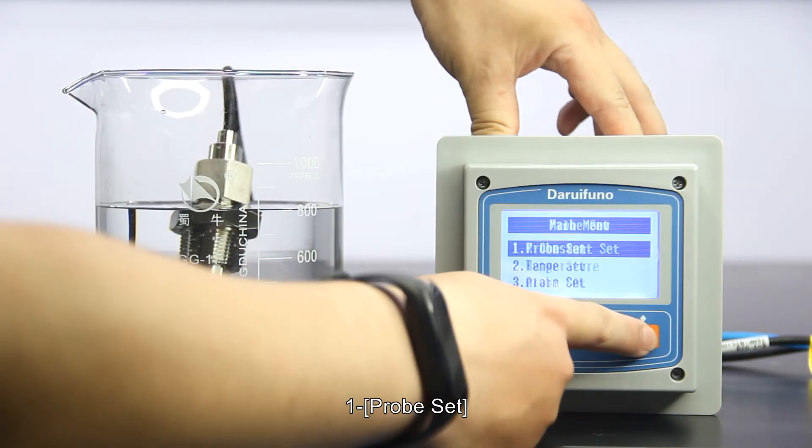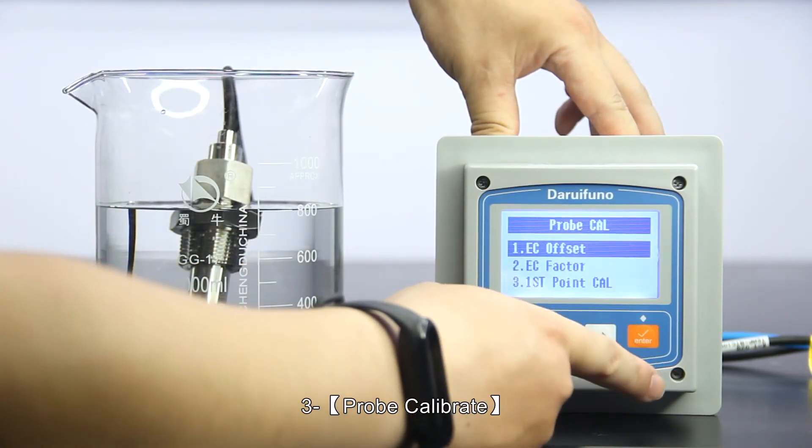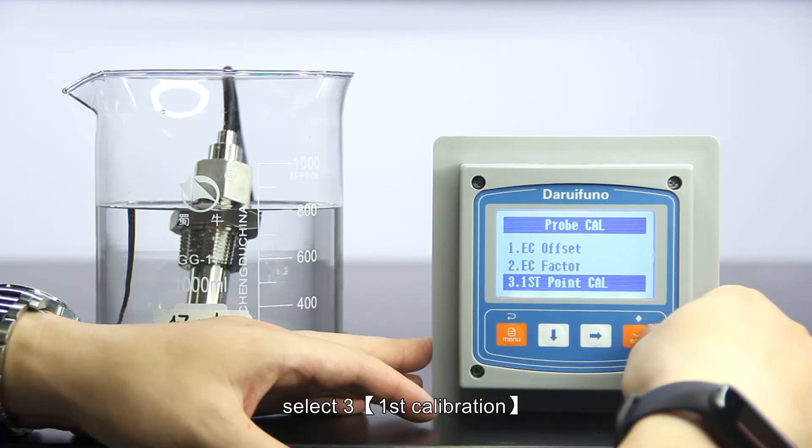Long press the menu key to enter. Select probe set, then probe calibrate. After entering, select first calibration.